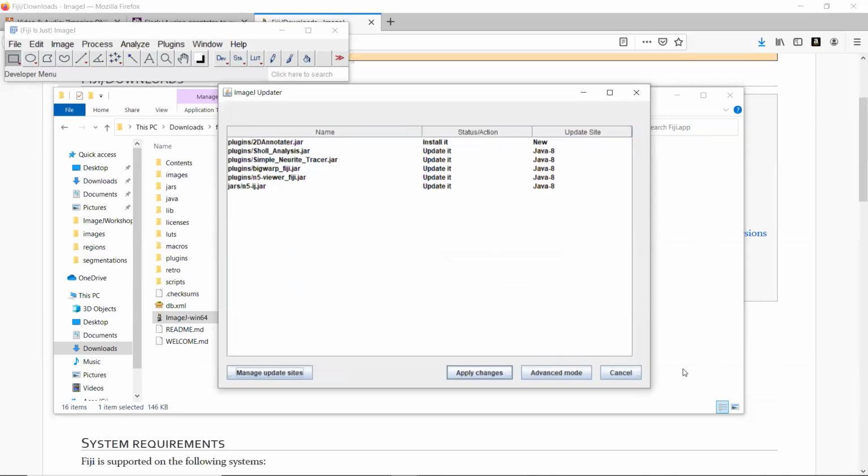So I just want to make sure that everybody followed here because that's important. Anybody is fine? Is there any questions so far? Any problem? Seems to be right.